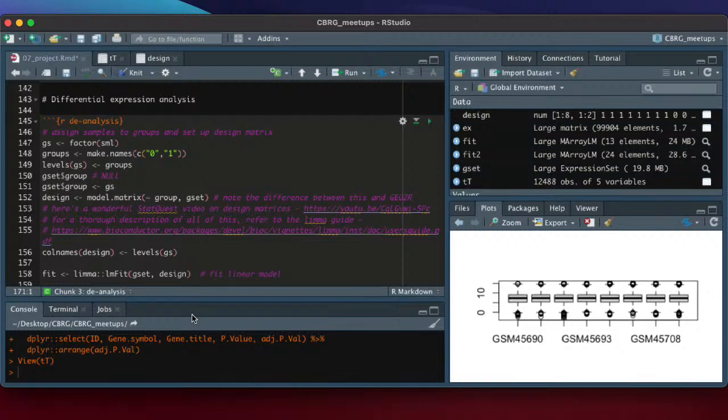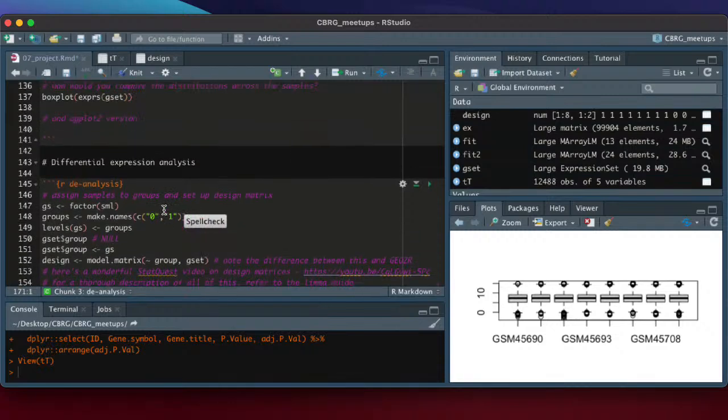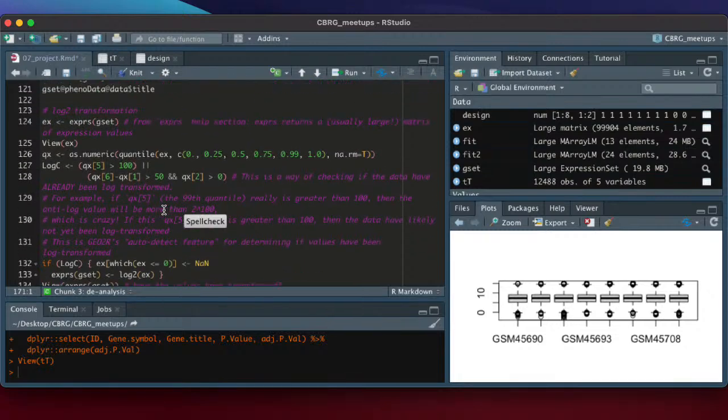So I'm assuming a lot of these little steps we talked about, you can just copy and paste. Yeah. Put in your own data set. The other thing I had a question about was the section where you had the double bracket 1. Yeah. What did that one actually signify, and is that something you might have to change at some point, or is that kind of a constant?